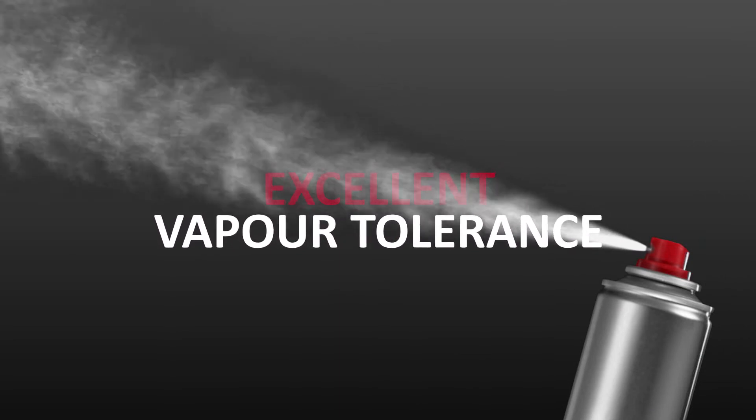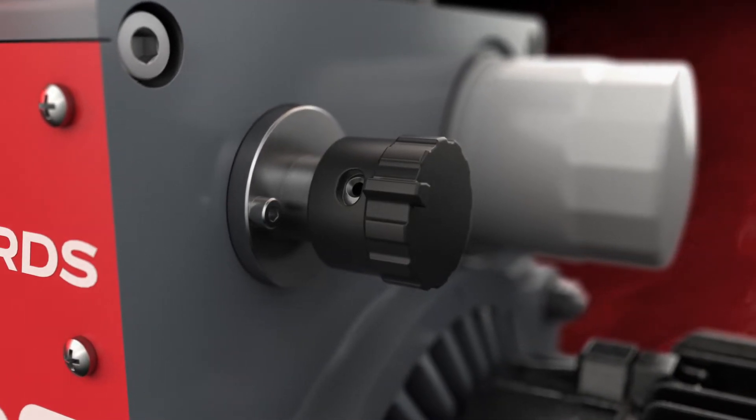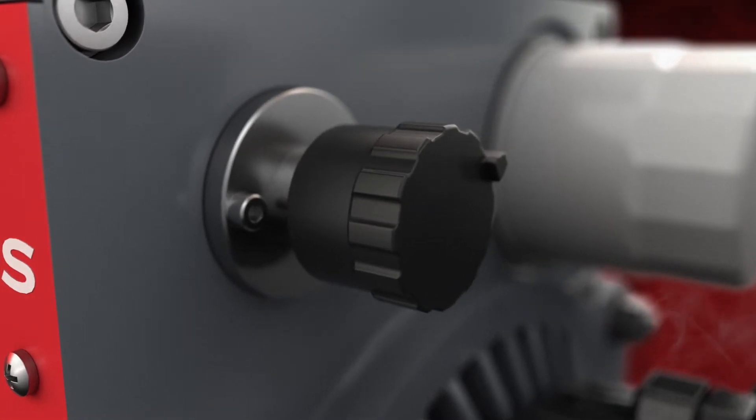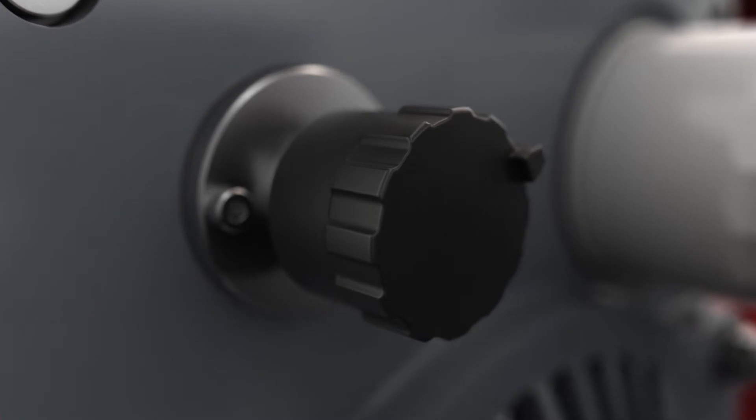It can adapt to your process. The Hydra mode boosts the vapour tolerance of the machine and prevents condensation. Put the pump in fine vacuum mode and it will operate at lower ultimate pressure while still handling vapour more than capably.